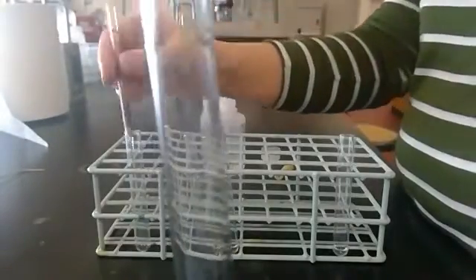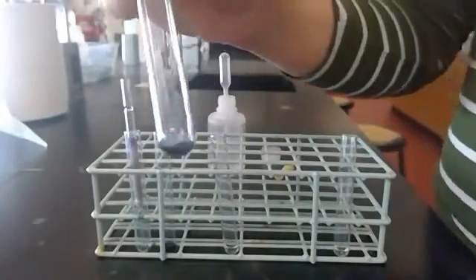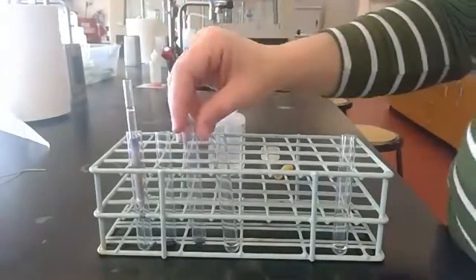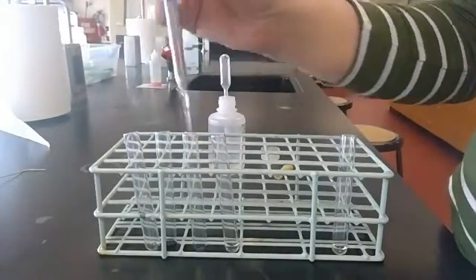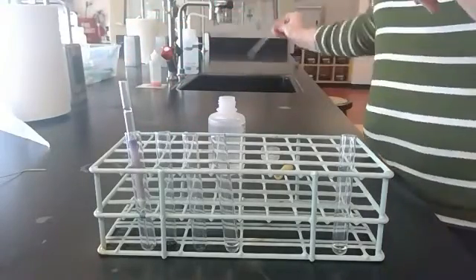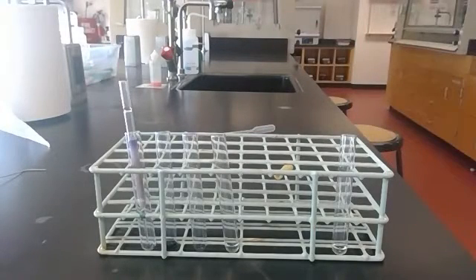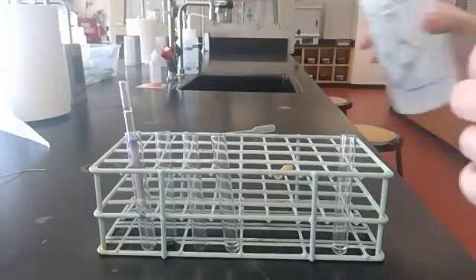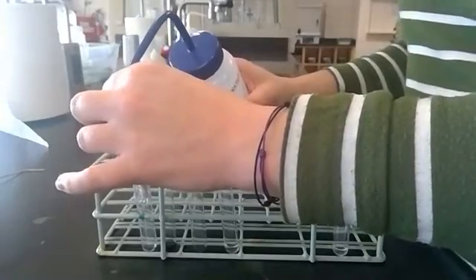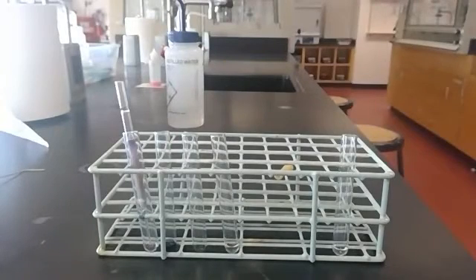I collected this fraction right here. It might be easier to see this color right here as a nice light blue. So now I'm going to keep going, and I'm actually going to switch to a different solvent. So that was with my less polar isopropanol solvent. And now I'm going to layer just a touch of water. Actually, let's do another layer of isopropanol. Just show you what that's going to look like.